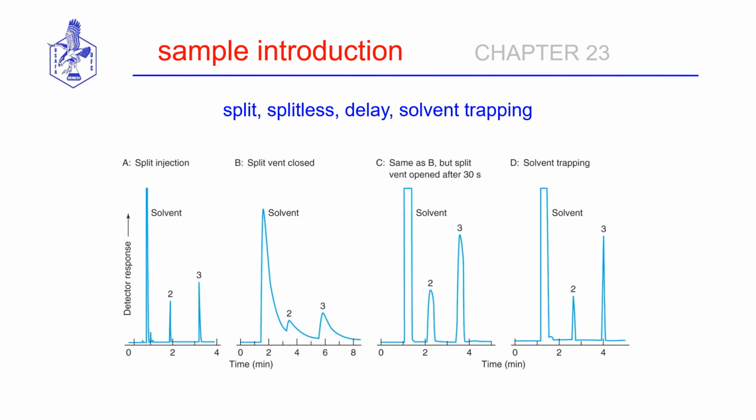To demonstrate the chromatograms that would come out if you run a sample split versus splitless, the following diagrams will show this impact. If you run your separation split, only a portion of the sample hits the column. We're not overloading the column and the fixed amount of stationary phase available.